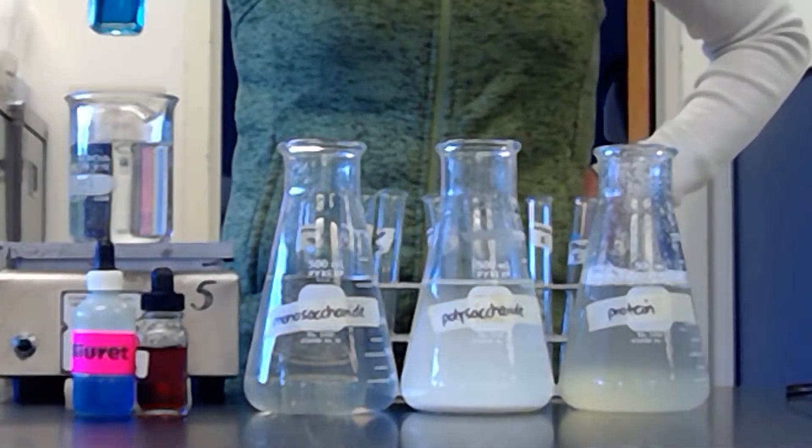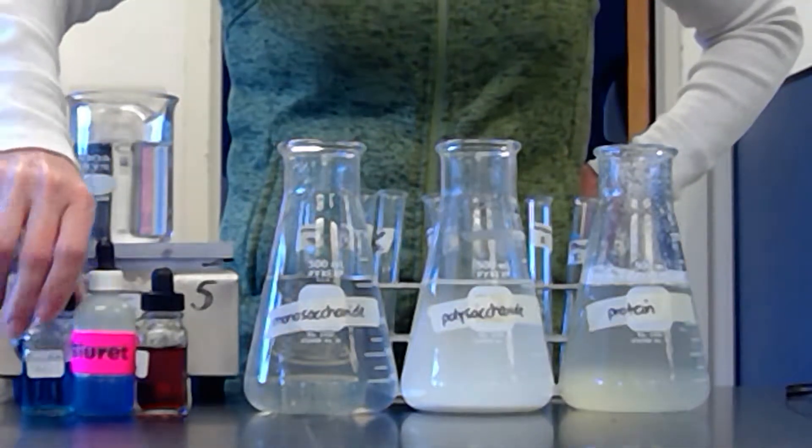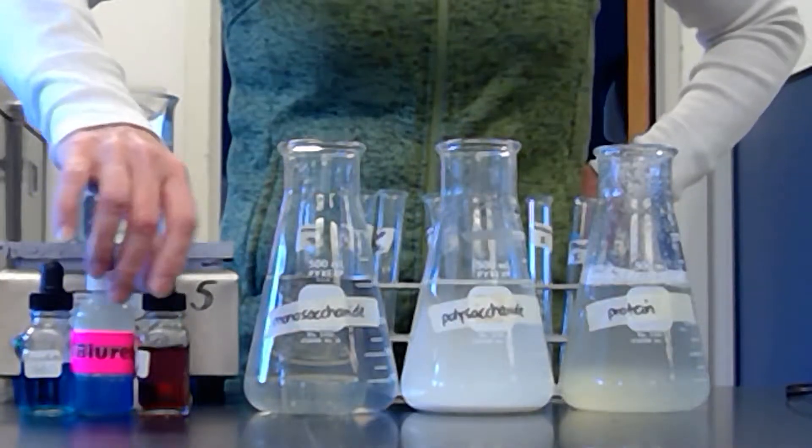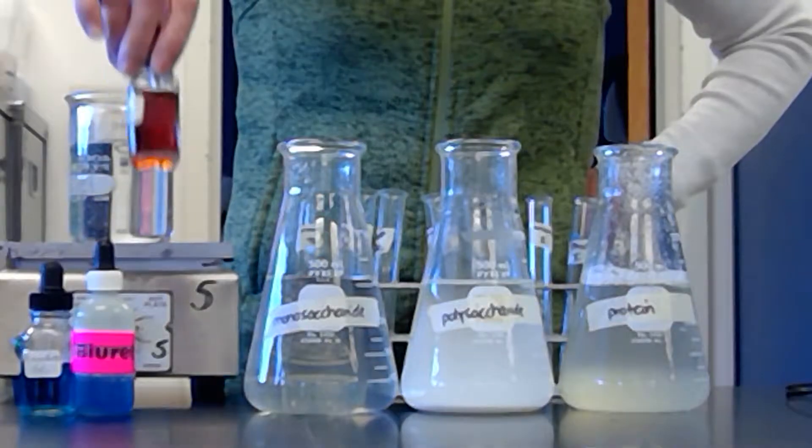If you see the color, it's sort of aqua to begin with. And then this is called biuret. It's kind of a purpley color. And then this is iodine. It's kind of a yellowish brown.